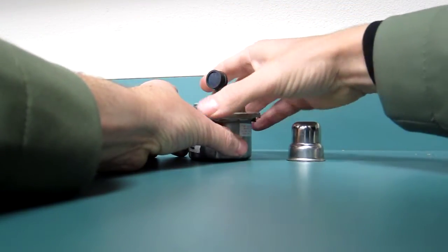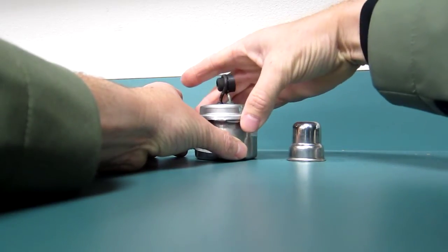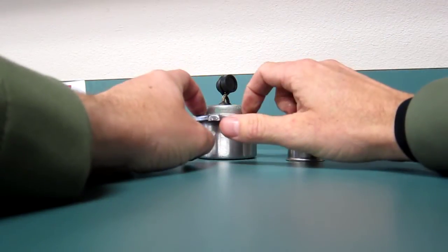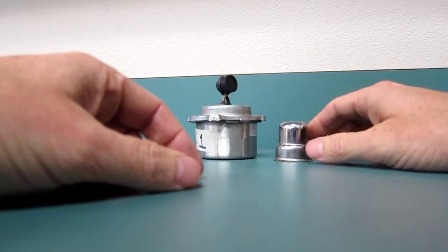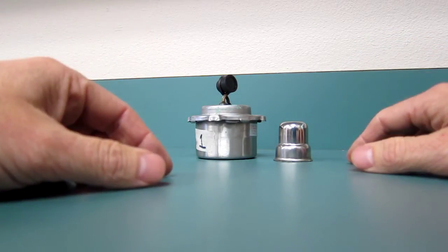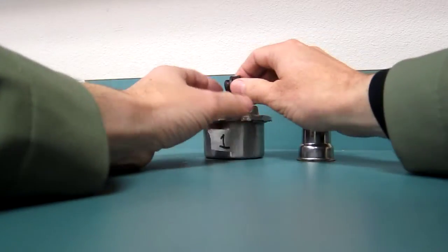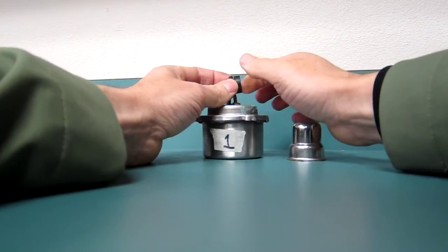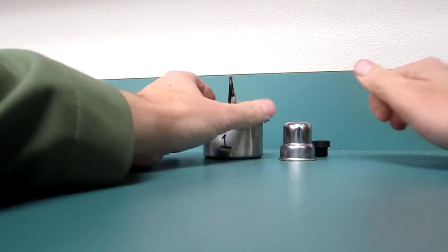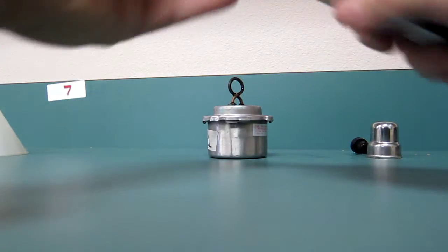So you can check for alcohol before you start a major lab, but you do that sitting down at your desk with your goggles on and apron on. As soon as this top comes off in any way, goggles and apron are on. In fact, anytime you're transporting at all, goggles, apron on. Just make that a habit, okay? This rubber stopper comes out. Hold the metal here so you don't bend it, and you just sort of twist it out, okay? And just double check everything's sealed before you try to light it.